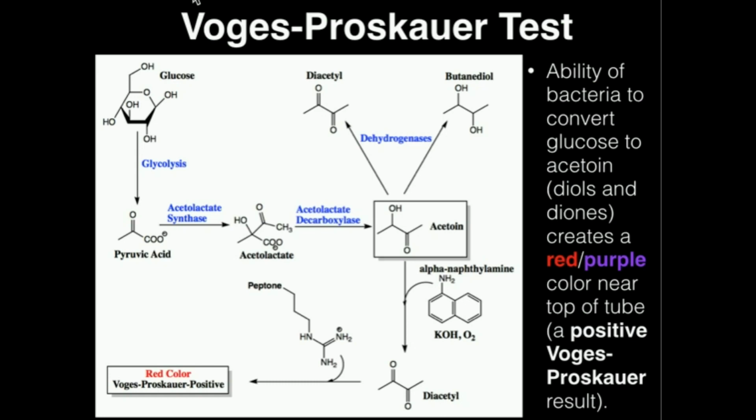My name is Kevin Tokoph. In this video, we're going to discuss the theory behind the Voges Proskauer test.